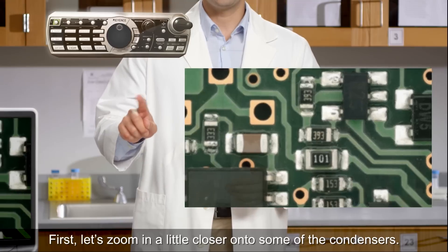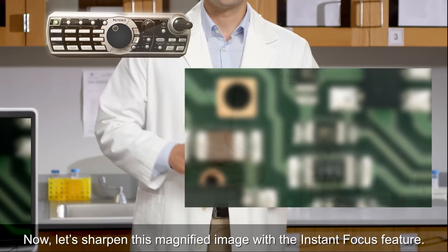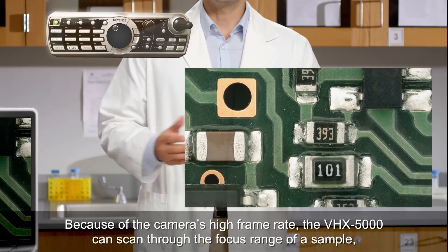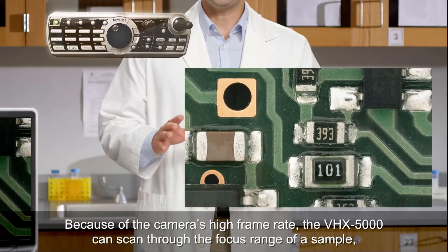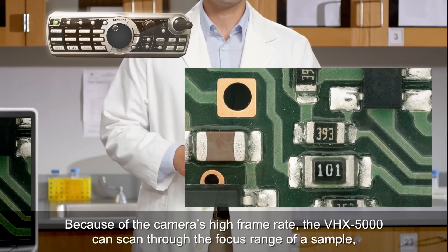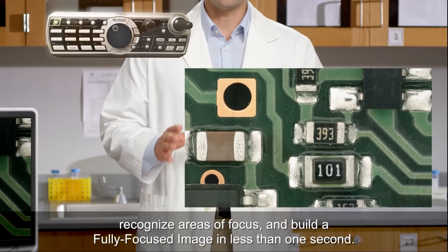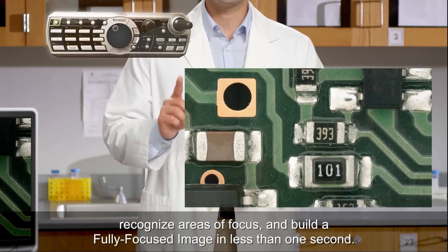First, let's zoom in a little closer onto some of the condensers. Now let's sharpen this magnified image with the instant focus feature. Because of the camera's high frame rate, the VHX5000 can scan through the focus range of a sample, recognize areas of focus, and build a fully focused image in less than one second.